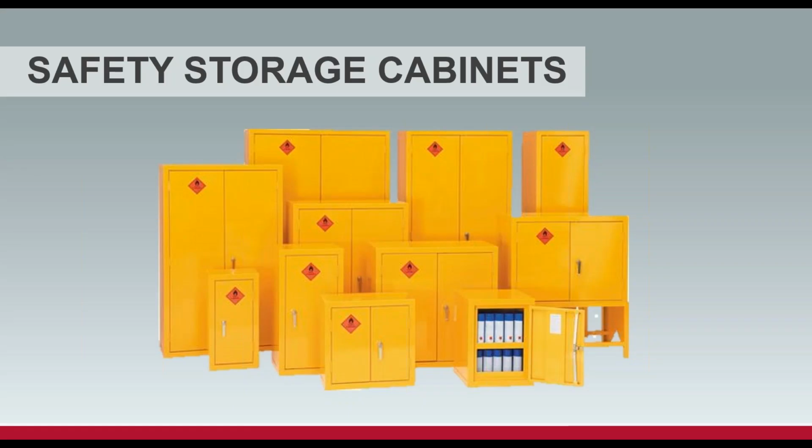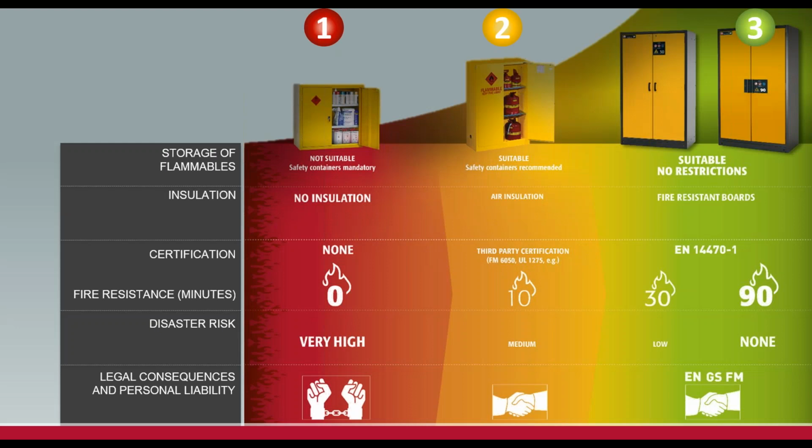So cabinets in specific, there are 3 types out on the market. The first one has no fire resistance at all. You'll see about 3 minutes of burn resistance. In my next couple slides, I'm going to show you a video of these burning, so you'll understand that. The one in the center has UL or ULC 1275. Your country's UL Canada trademark is tougher to get than UL. Some companies choose to have ULC or UL, and then of course you've got Factory Mutual, which both countries recognize.